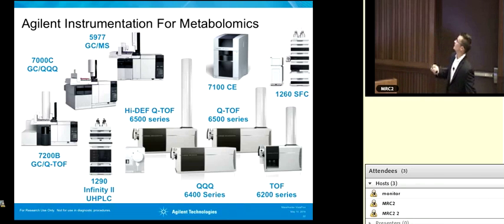In this case, there's a lot of information right here, because if you're looking at it from an entire pathway perspective, there's as much or as little information here as you want. The quilt plot's nice because it shows you the time course on the y-axis, and it shows you our isotopologues on the x. So we can see that at 0 hours, based off the dark red color, we're at no incorporation. And as we incubate, this dark red flips down to a lighter shade of pink as we start to see incorporation in some of the isotopologues.